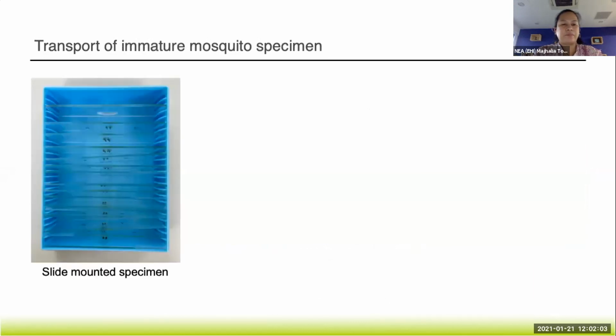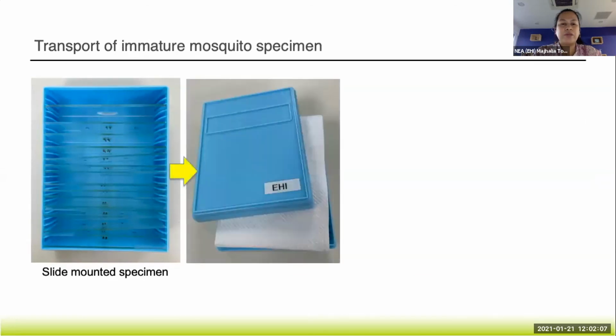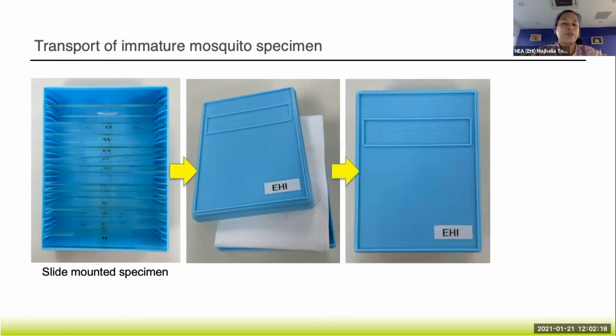Okay, so these are slide mounts, and for slide mounts you can use a slide box. But before you send out your slide box, always put this absorbent material on top to prevent things from shaking when they are being transported.